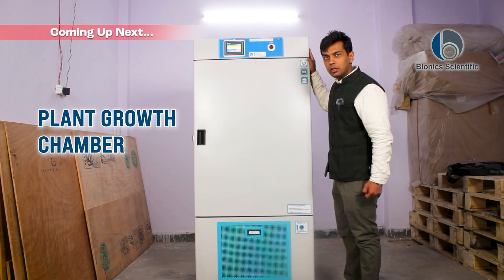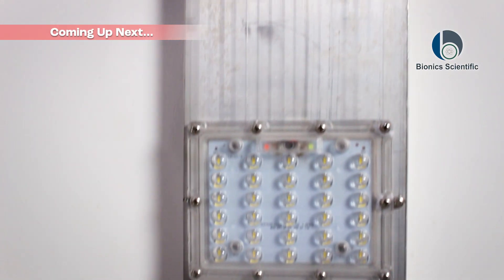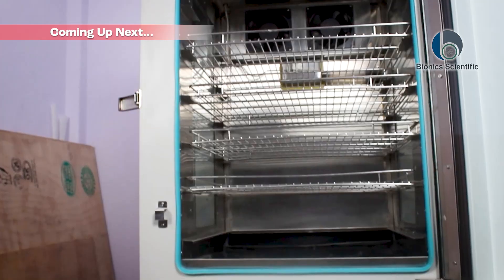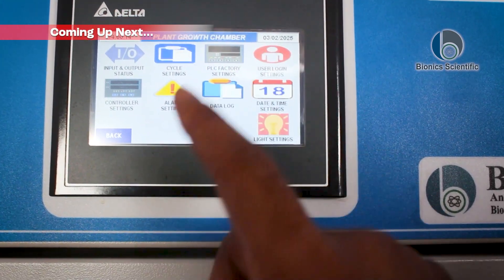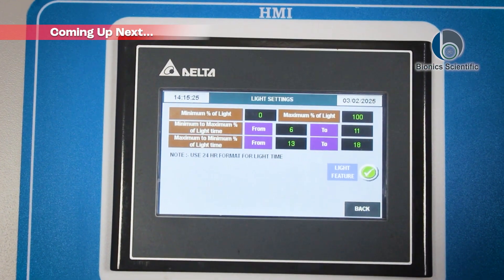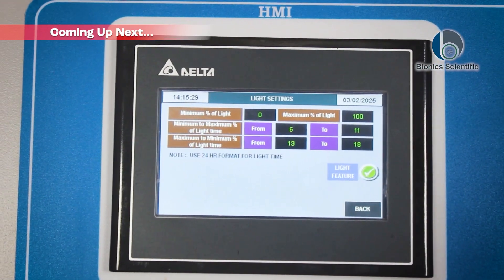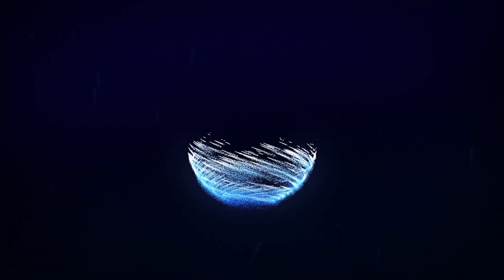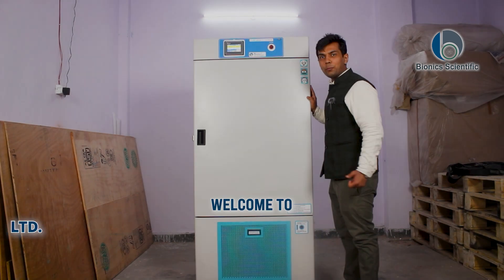This is the plant growth chamber. It contains illumination of 23,000 lux, as you can see over here. There are two circulating fans and five shelves available. You can set the temperature using the cycle setting icon. The maximum to minimum light time is from 13 to 18, which is our 24-hour time format. This machine will run accordingly. Welcome to Bionic Scientific Technology Spider Limited, a unit of Cartel Project Spider Limited.